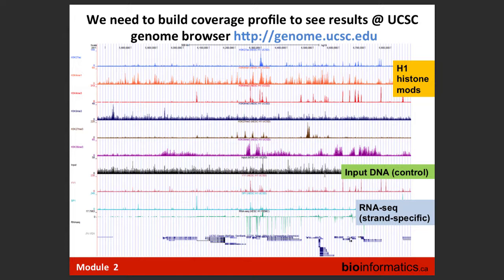We have our reads aligned, and as we have paired-end libraries, we have our paired reads aligned, so we have our fragments. And our fragments have different lengths, and if this is my genome, these are fragments, they're aligned like that, and then maybe there is a single read aligned here. And then we generate a coverage profile. So essentially, here is one read, up to here it will be one, then it starts two. Then here we have three reads, and then further we have four reads, and then the four reads stop, and then it's three again, or actually it's very little three, and then it drops to two, and then there are two reads, and then there is one read. So that's what we see there.